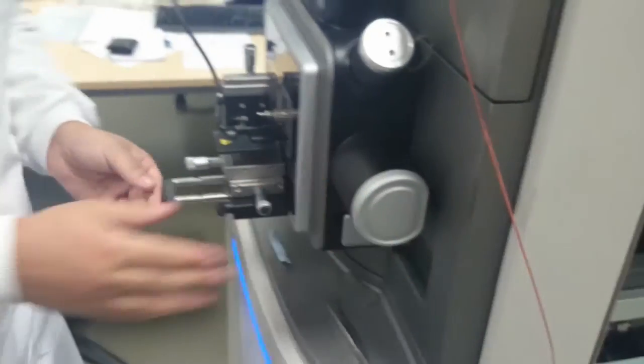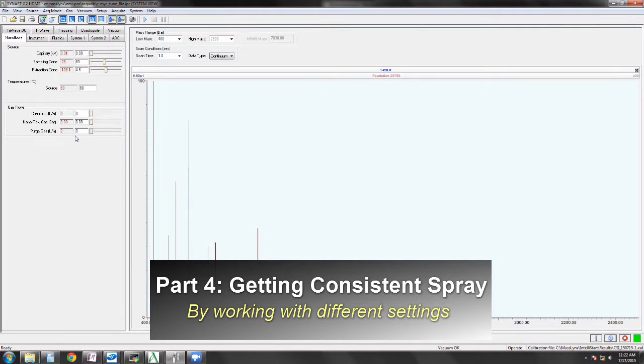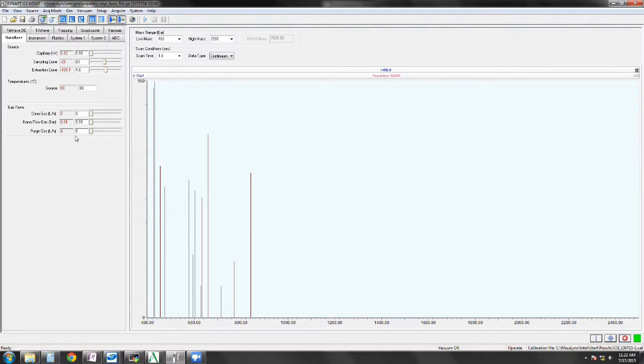When the instrument's all ready to go, close the source up, and we're now ready to acquire signal. Now we have our sample in the instrument, the tip is in place. We can now start acquiring some signal. I'm going to point out a few features of the software. Again, it's different depending on what instrument you have. There are certain key features that will be true throughout.